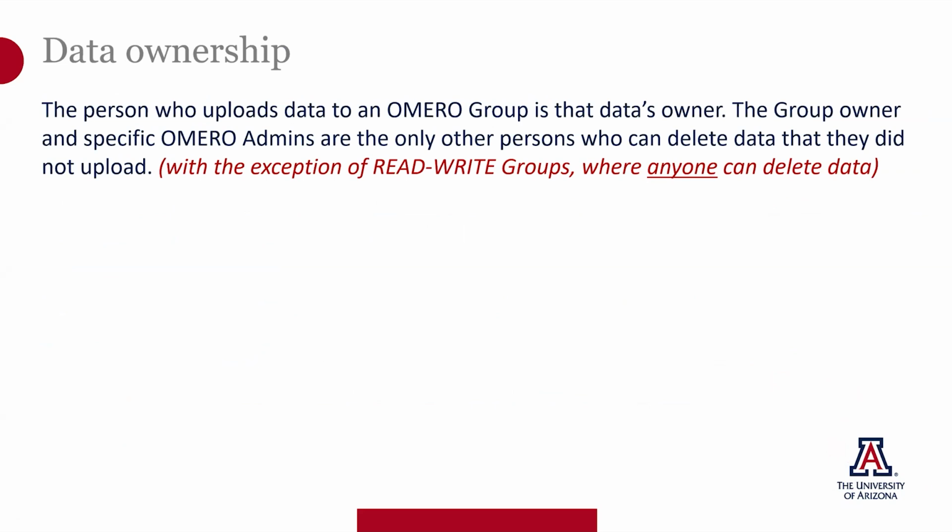I'd like to talk just a little bit more about data ownership. We've mentioned this before, but as a reminder, whoever uploads the data into an OMERO group is the data's owner. The group owner, along with some specific OMERO administrators, are the only other persons who can delete data that they didn't upload. And we encourage you to watch the OMERO groups video for more on this topic.